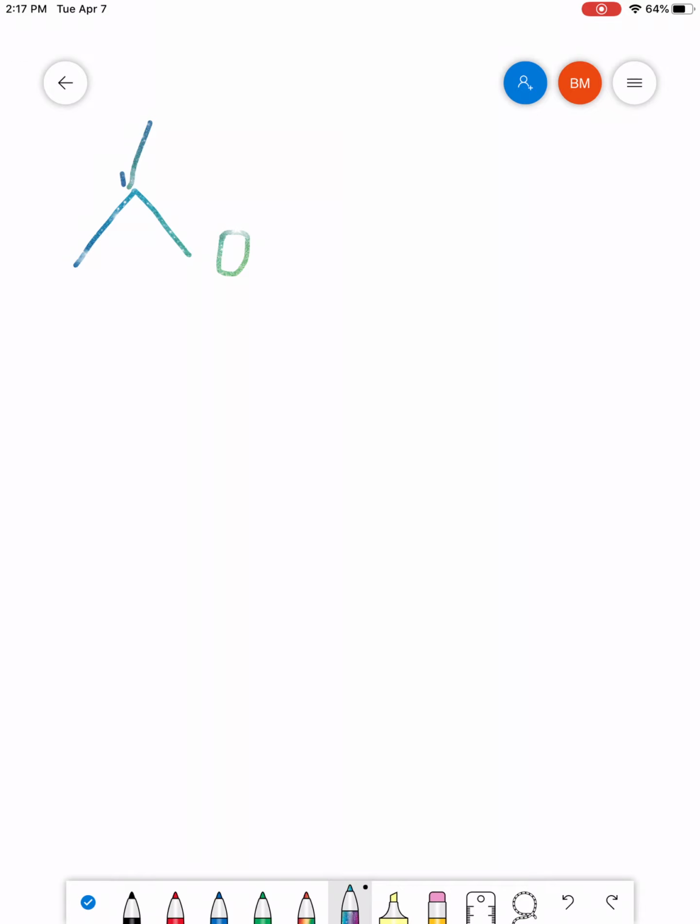You can also extend these. You can have molecules that have heteroatoms in the middle, like an oxygen or nitrogen, kind of separating things. But you see the same basic analysis, right? This is diisopropyl ether. And if we look at this, it definitely does have a line of symmetry, right? It goes right through that oxygen.